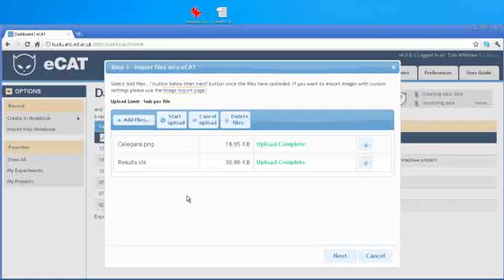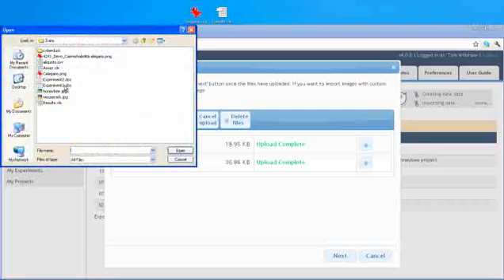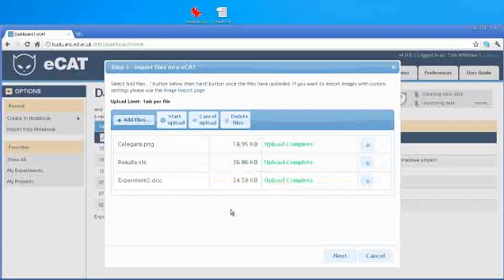And you can do that kind of drag and drop with any browser except for Internet Explorer. On Internet Explorer, and also you can use this in other browsers, you can just select files from here. So for example, we might select this Word document, and now that's uploaded. So then we just go to the next step.